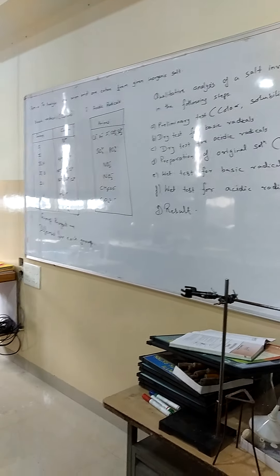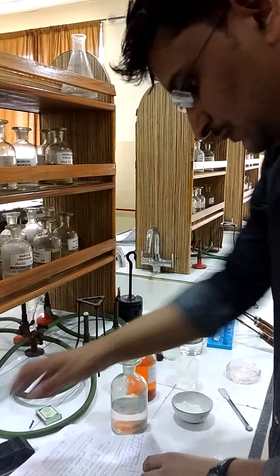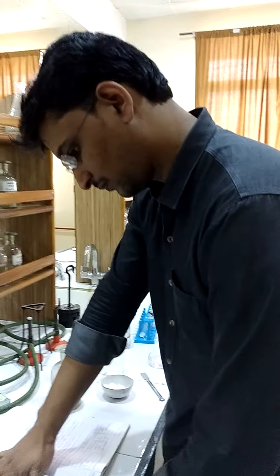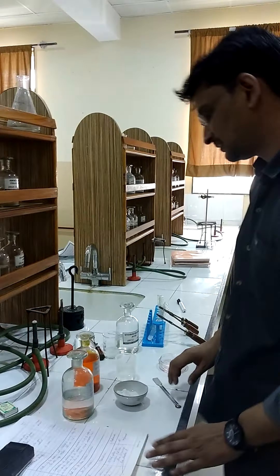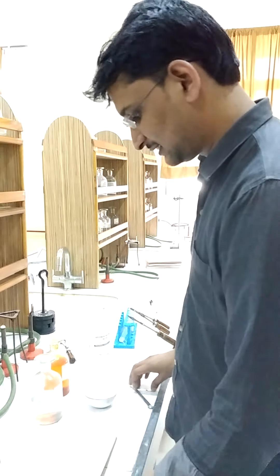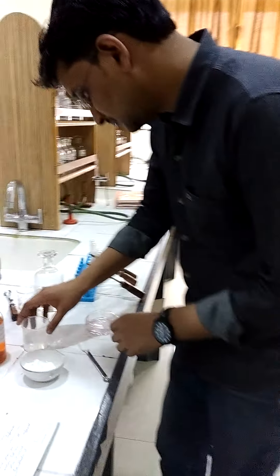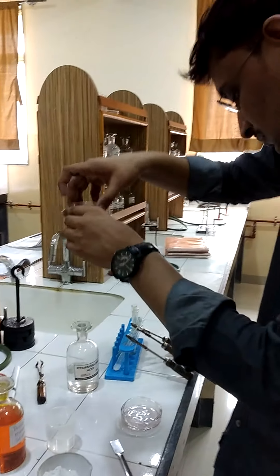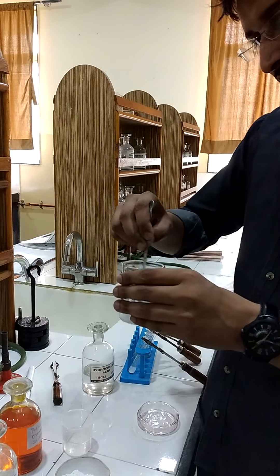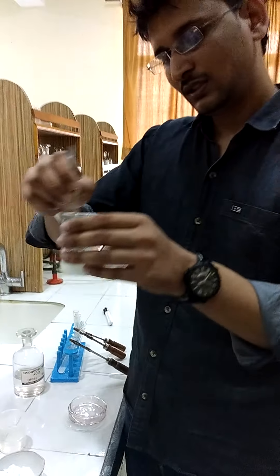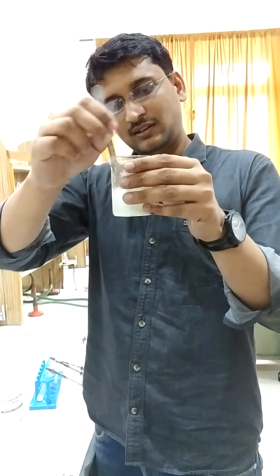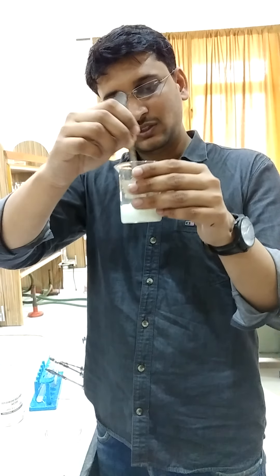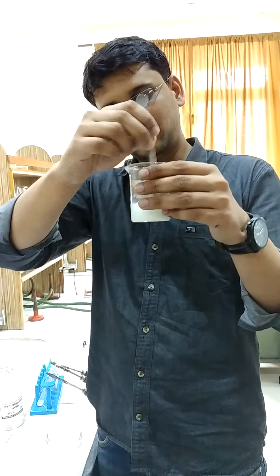Now as we did the preliminary test, we are going to do group analysis. For group analysis, first we will prepare OS, the original solution. Here I have taken 5 to 7 grams of salt and 50 ml of water.